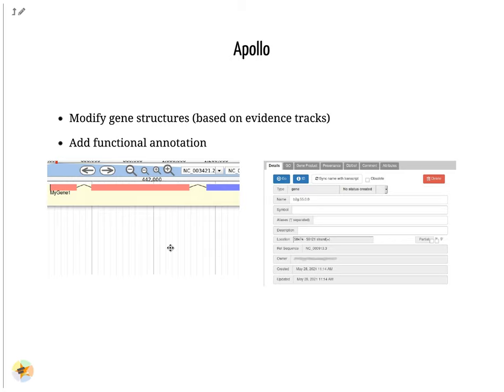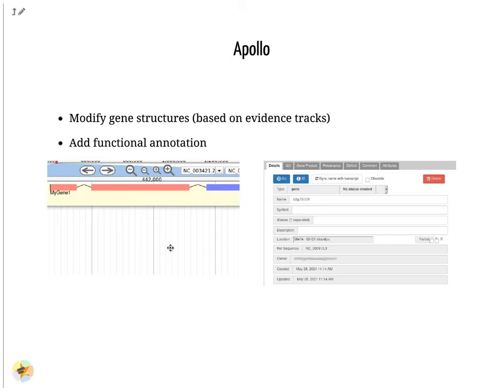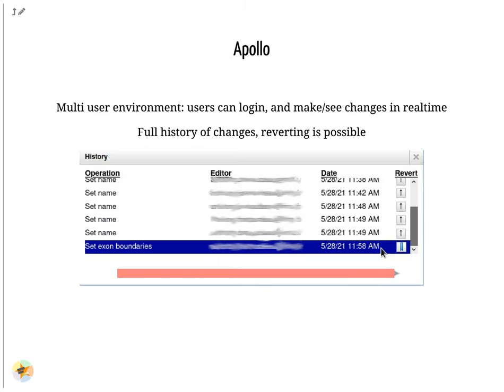Within Apollo, you can easily change the structure of genes based on evidence tracks. Apollo offers an interactive interface to help you add functional annotation. Apollo is a multi-user environment, which means multiple users can log in at the same time, make changes, and see changes made by other users in real time.